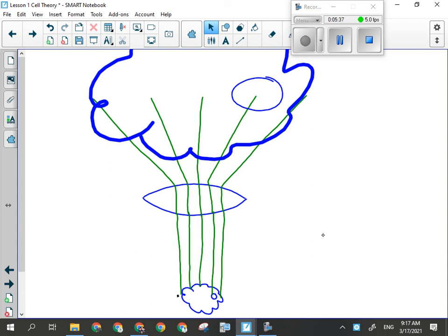It's going to put it onto a curved mirror that's going to diverge the light so that when you look at it, it appears larger. Everybody okay with that? Okay, so that's how a microscope works. The reason I've just explained that is because you have to explain that in the lab, in your own words. Does everyone kind of follow how the path of light changes?